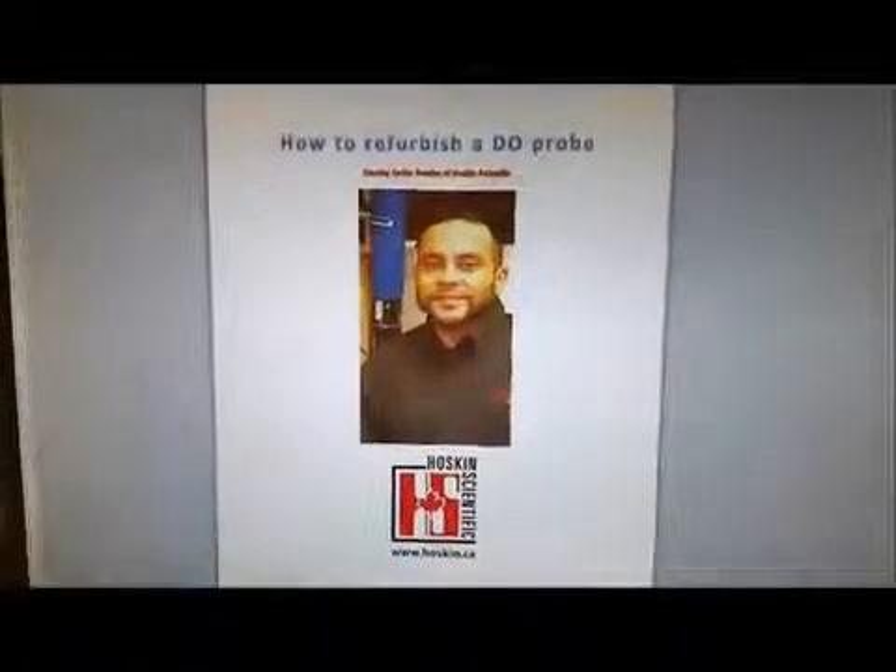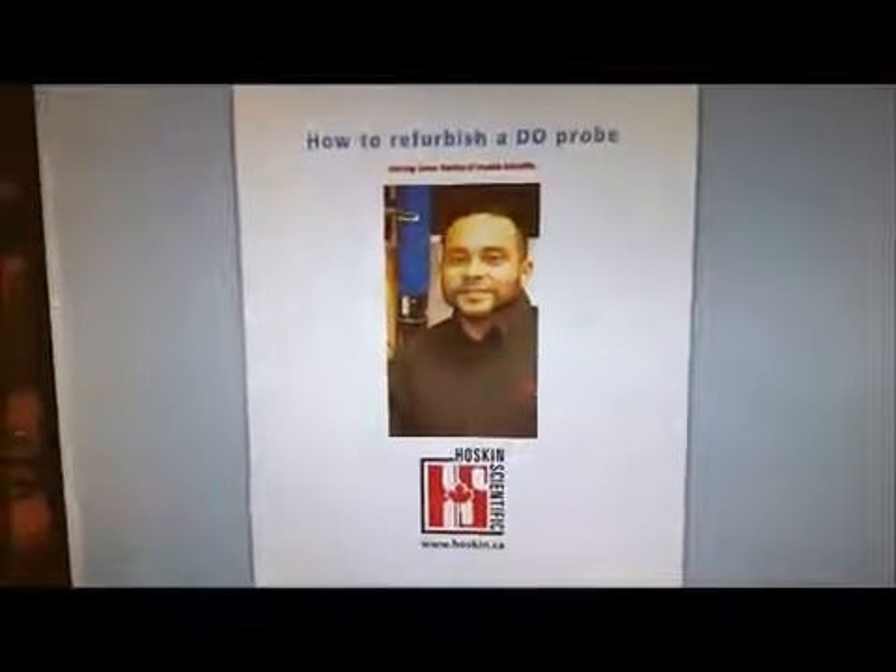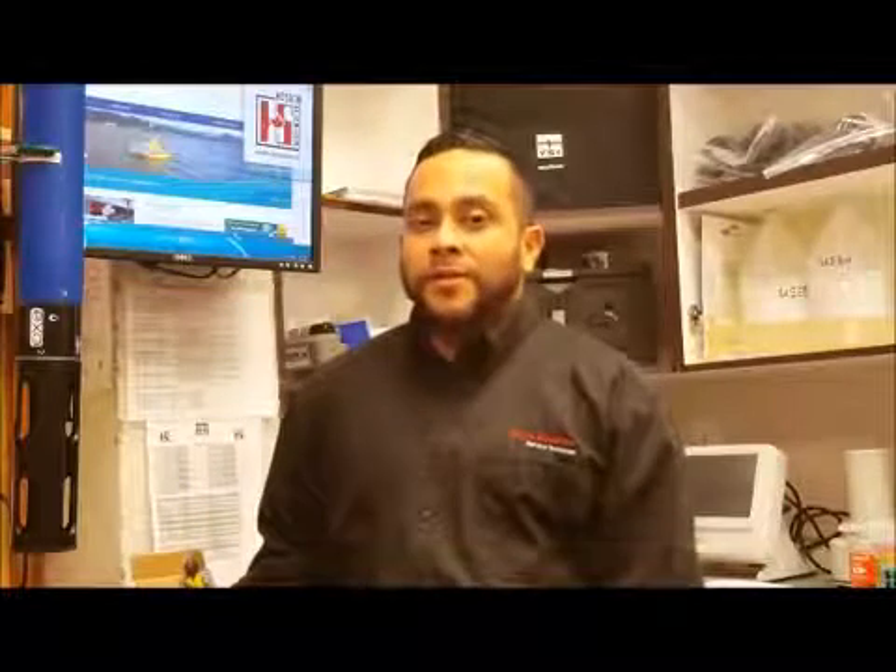How to refurbish a DO probe with Carlos Rendon from Hoskin Scientific. My name is Carlos Rendon and I am one of the technicians from Hoskin Scientific. Today I'm here to show you how to condition and change the membrane of a galvanic DO probe for your YSI ProPlus.